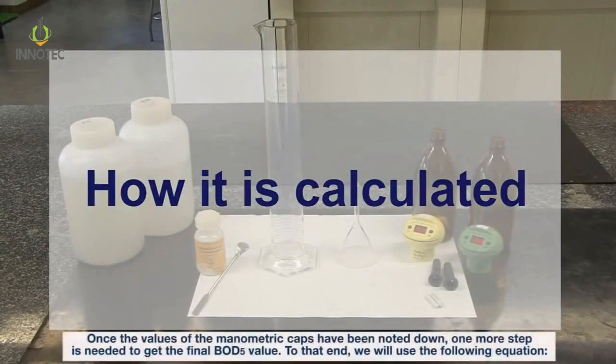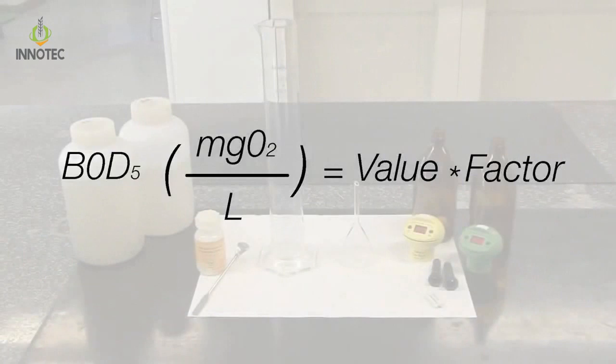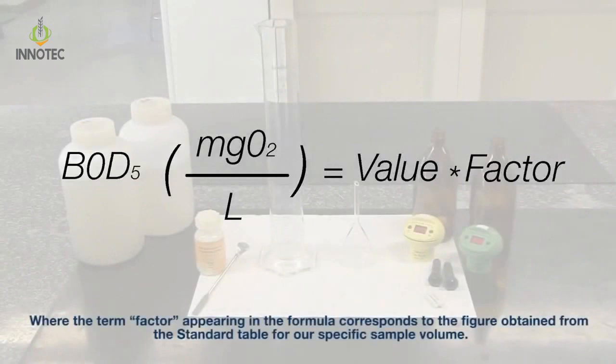Once the values of the manometric caps have been noted down, one more step is needed to get the final BOD5 value. To that end, we will use the following equation, where the term factor appearing in the formula corresponds to the figure obtained from the standard table for our specific sample volume.